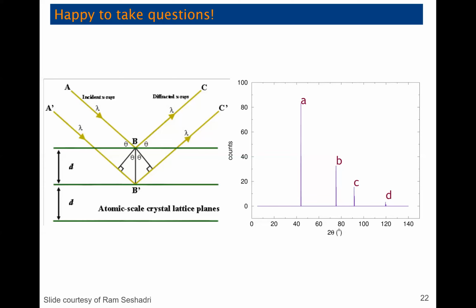It's not going to help you if the material is amorphous and so it doesn't have a regular crystal lattice. But then again, you can tell that from X-ray diffraction too. You can say, wow, I didn't get any peaks. It's all, I don't know, weird large bumps. Then maybe I'm looking at a glass.